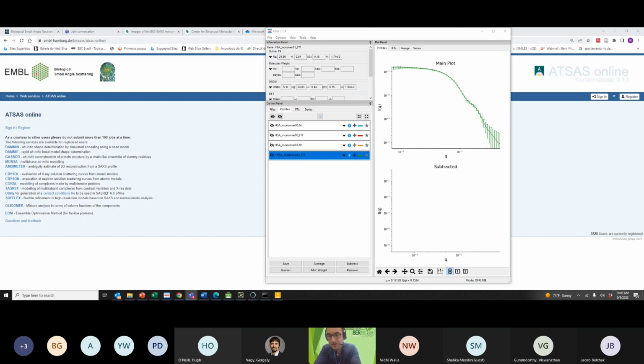When you say the Kratky, you are talking about the dimensionless Kratky or the regular one? The regular one.